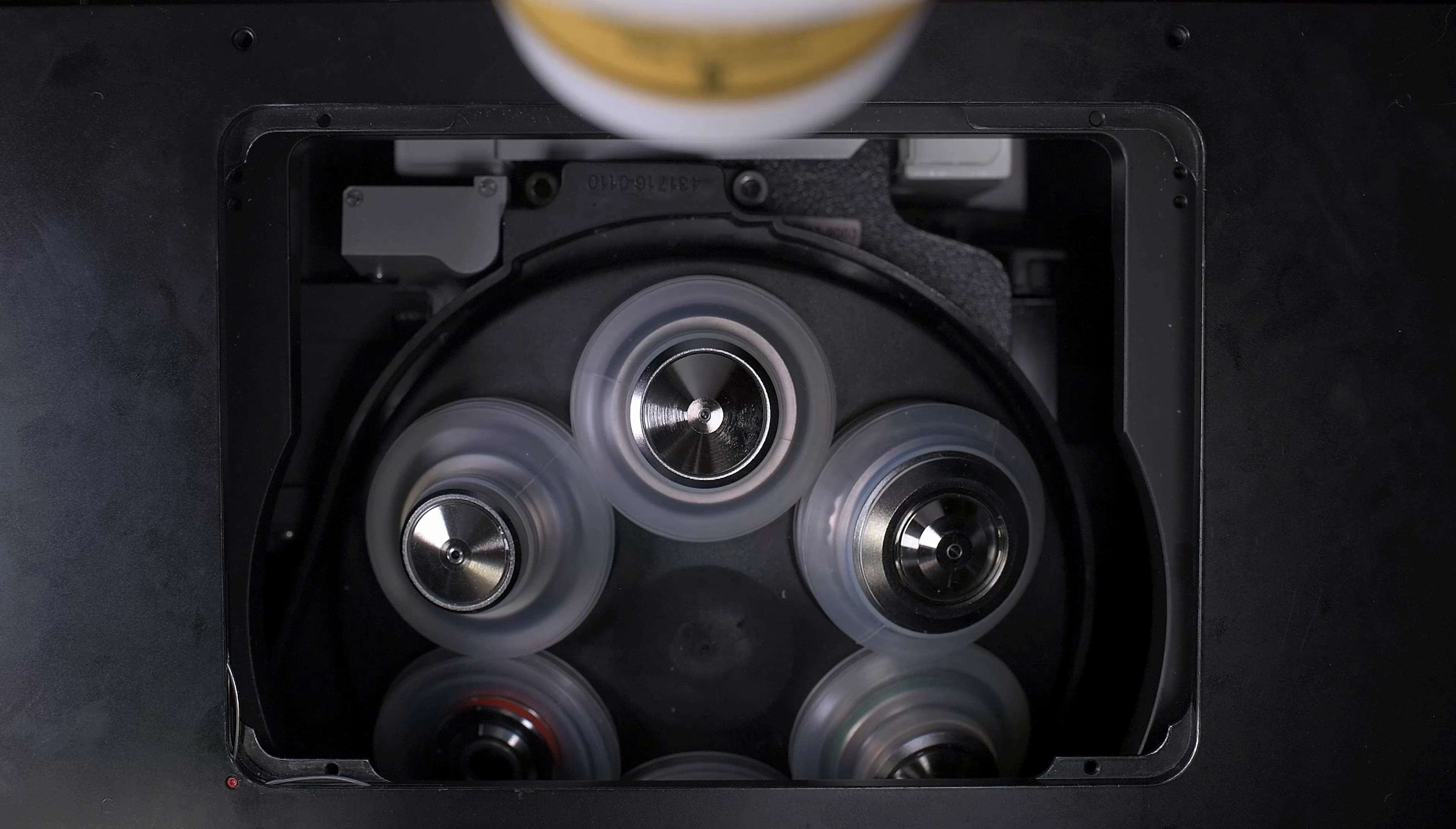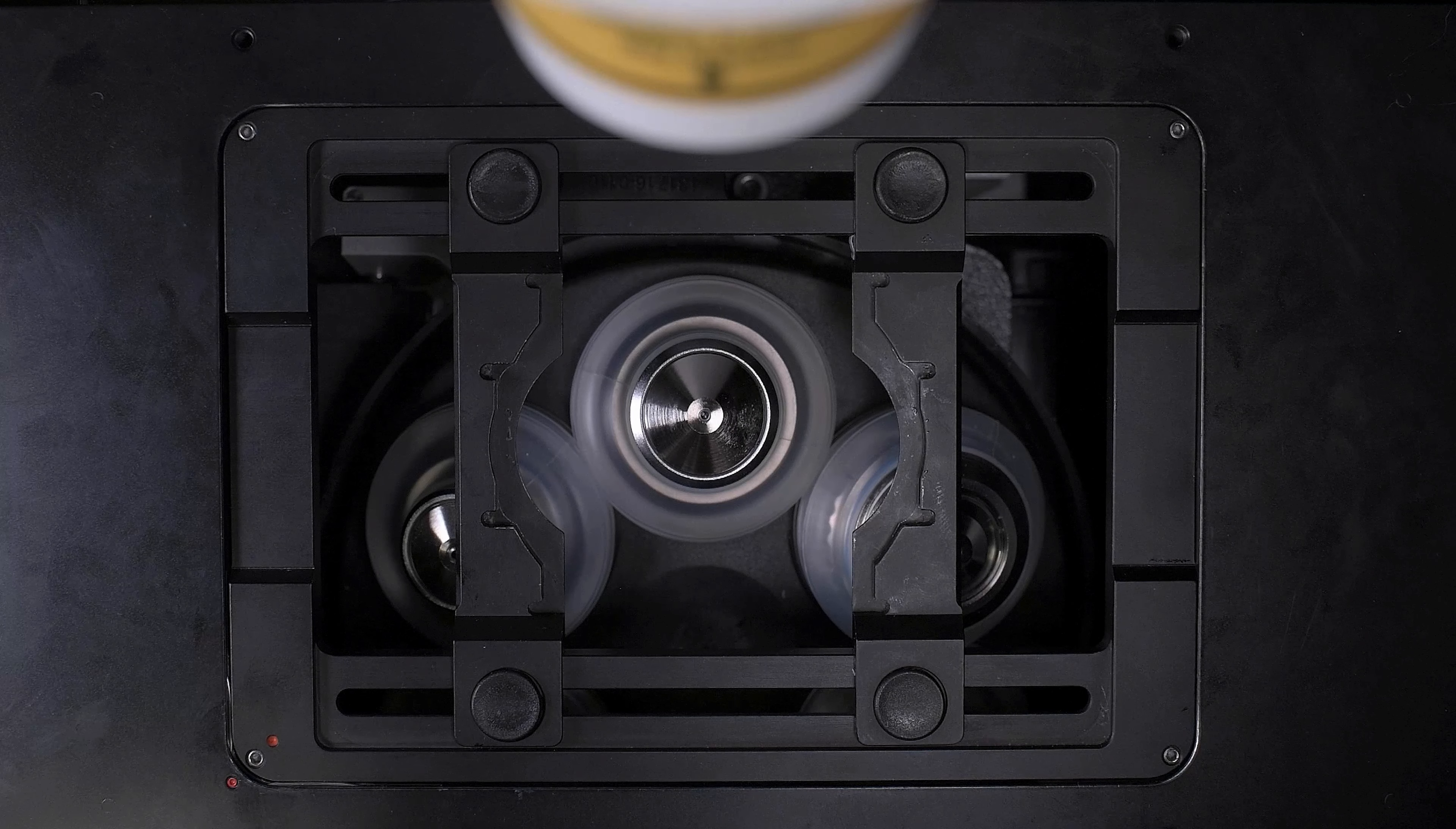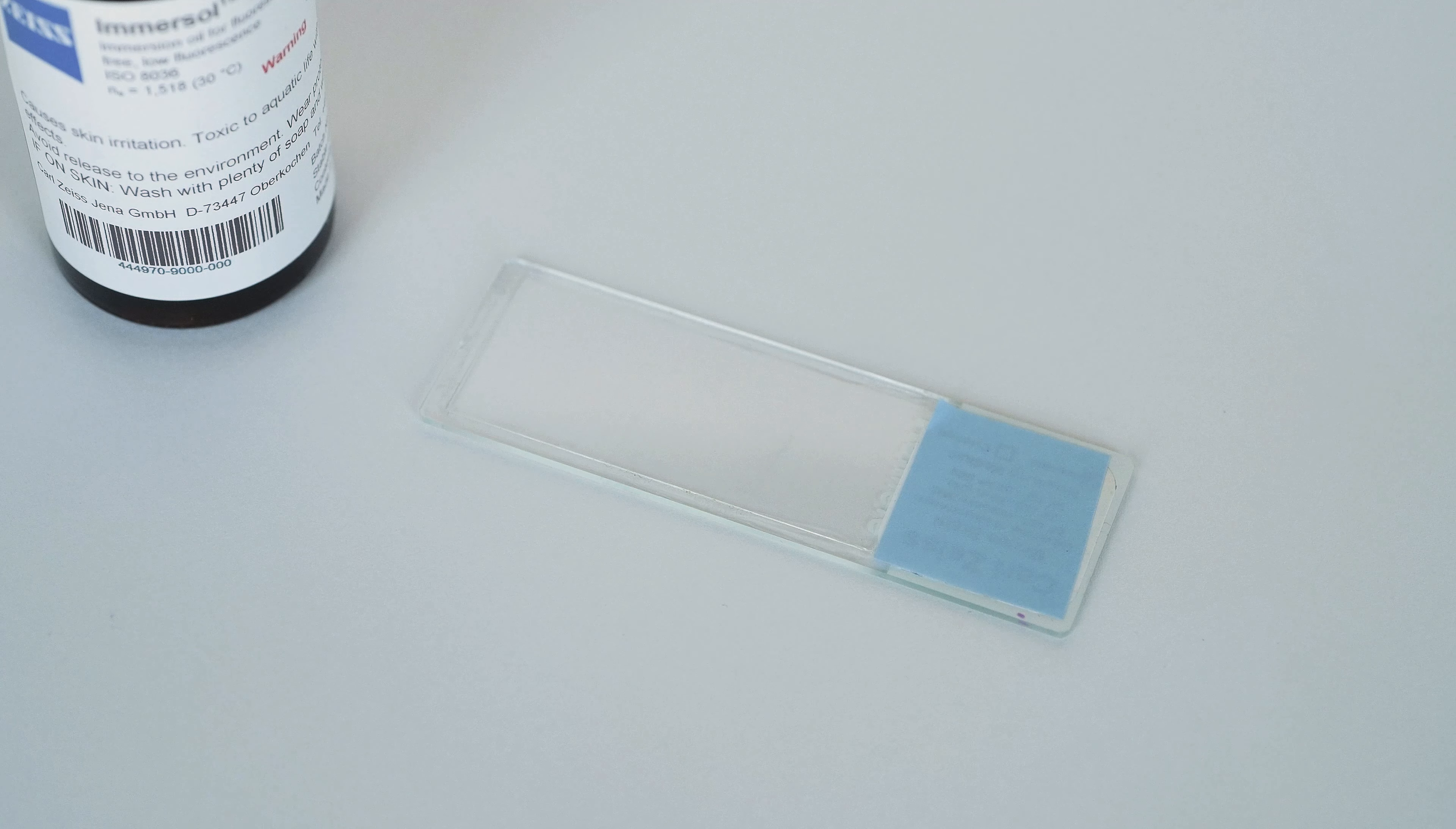To mount our specimen, choose a sample holder that can be inserted into the universal slot on the motorized stage. Mount this sample holder as discussed in our previous microscope training. Before we mount our slide into the sample holder, we will need to add a small drop of immersion oil to our cover slip. Whenever possible, we try to apply the immersion fluid to the sample rather than directly on the objective. This way we can avoid potentially scratching the lens while applying the oil.